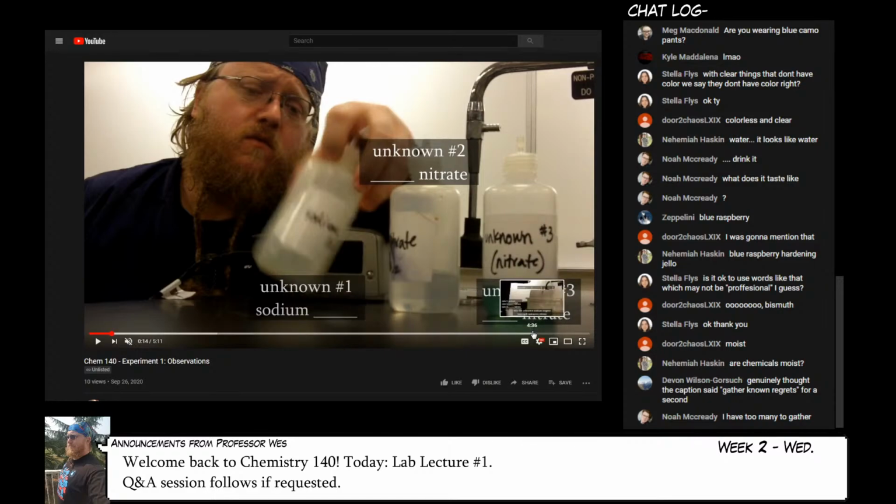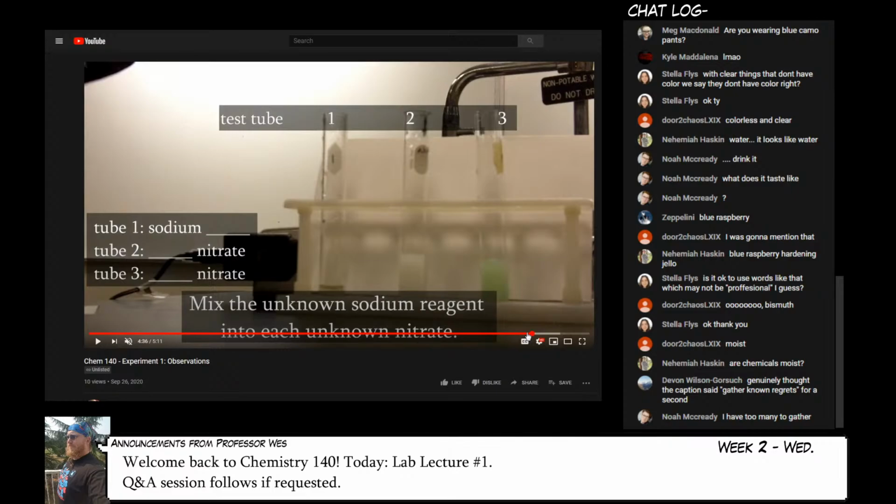At the end of the video, what I do is I mix the unknowns together. I mix the mystery sodium substance into tube 2, which is a mystery nitrate, and tube 3, which is a mystery nitrate. And I have results here. Be very careful with the colors of the unknowns in the results here. Okay? It is possible to determine the correct answer, but the differences are very subtle.